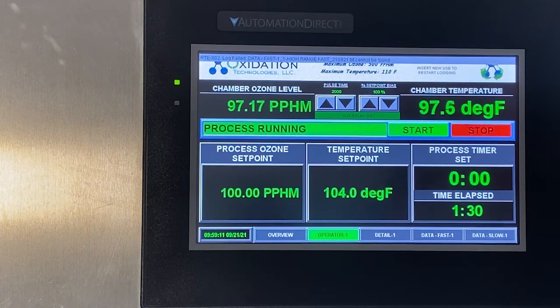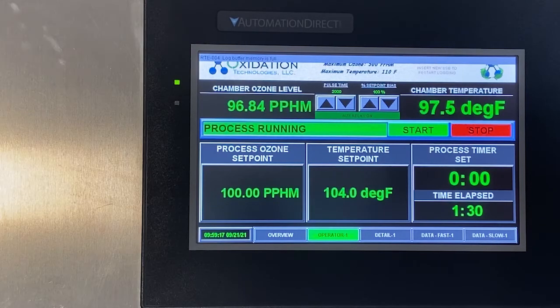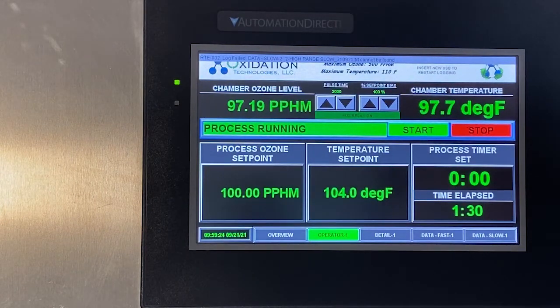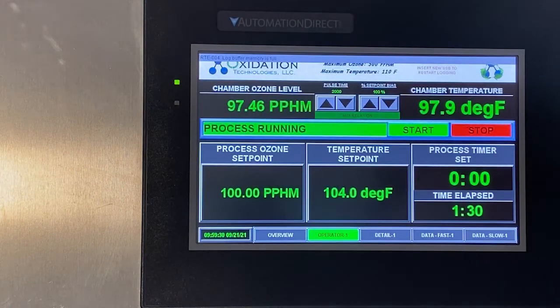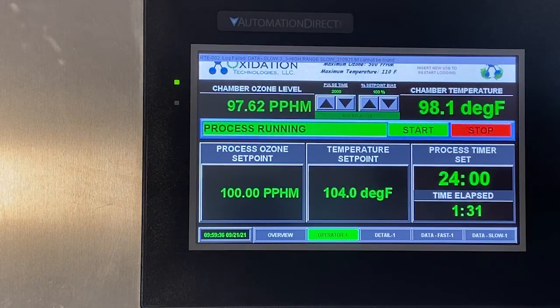Operation of the CH1 ozone test chamber is very simple. First, place the items to be tested inside of the chamber. Then you will enter the ozone set point, then you will enter the temperature set point, then you will enter the time set point. Once all parameters are set, you can press start.